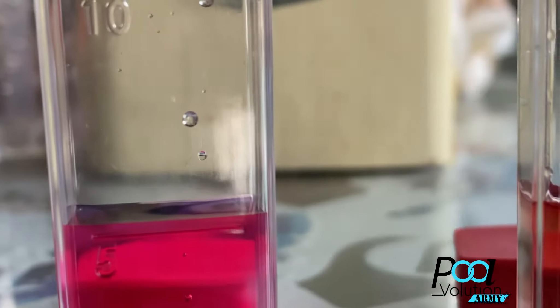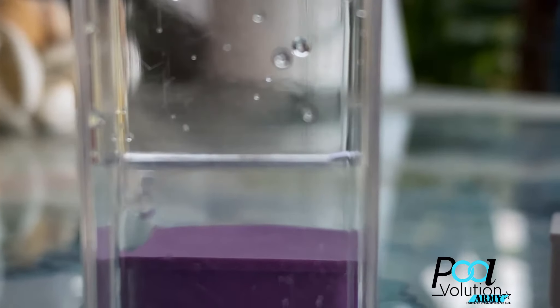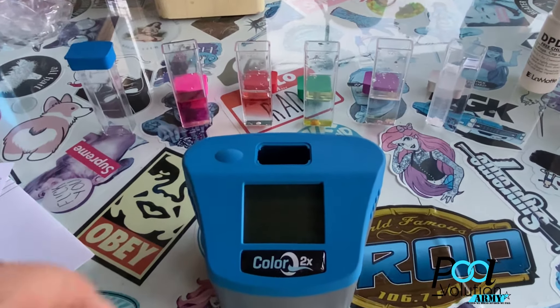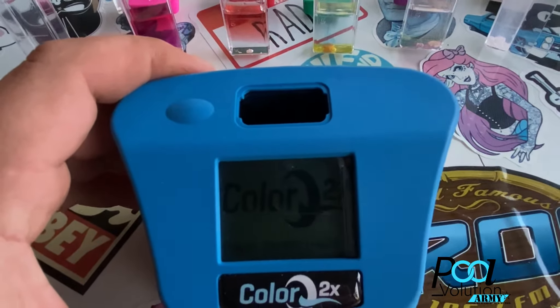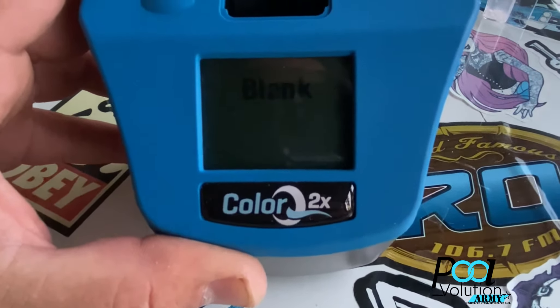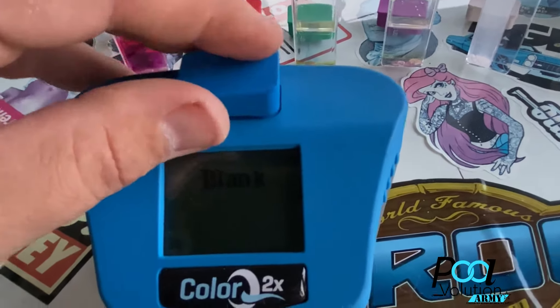I've added the reagents: five drops of 1A and 1B for the chlorine, five drops just for the pH, a tablet for the alkalinity, a tablet for the calcium hardness, and a tablet for the cyanuric acid. So far it's been pretty easy. Remember, this is Bluetooth just like the Spin Touch, and you get to use the Water Link Solutions app — so for $200 this is a pretty good deal.